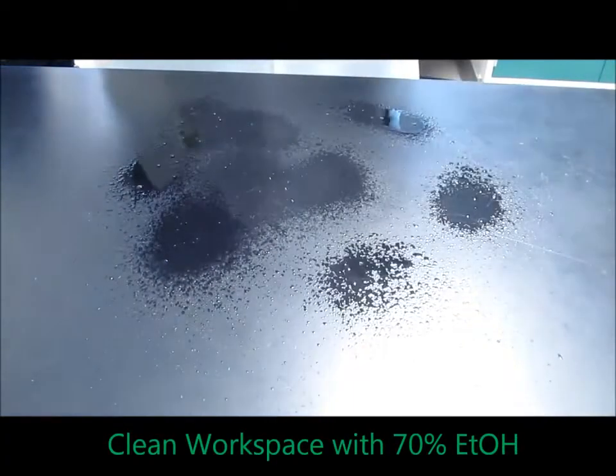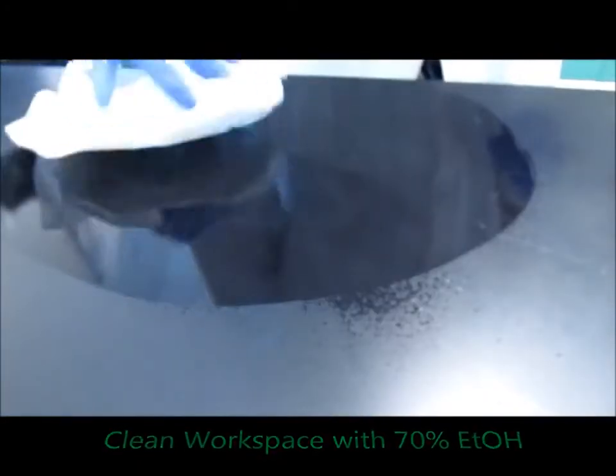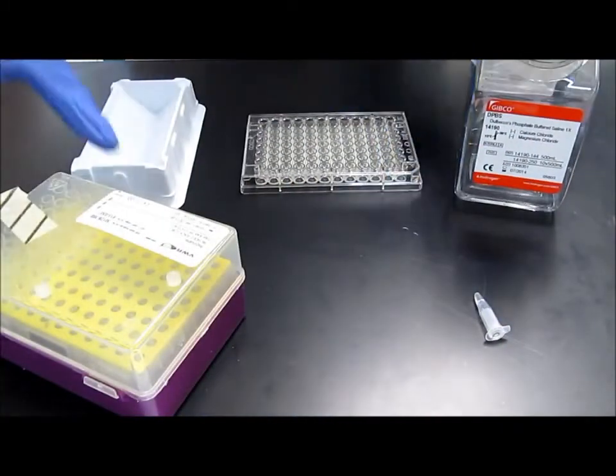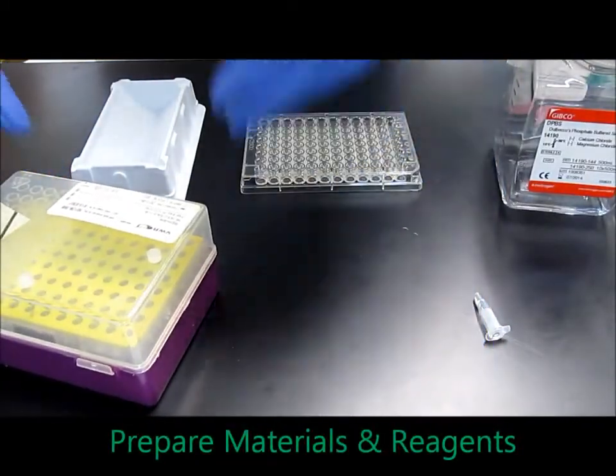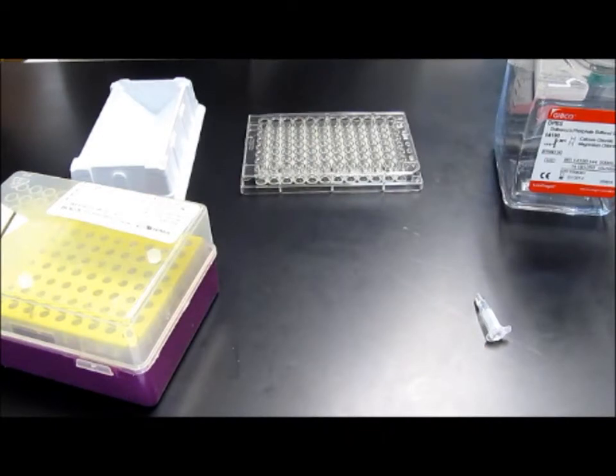The first thing you want to do is spray your surface with ethanol to wipe away any dust, and wipe it with a Kim wipe or a paper towel to make sure that you're working on a clean surface. And then after that, you're going to prepare all of your materials and reagents. The materials that you're going to need include your pipette tips, an empty reservoir, the 96 well ELISA plate, some DPBS or PBS will work, and you're going to need a vial containing an aliquot of capture antibody.